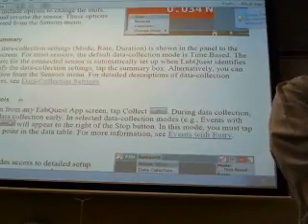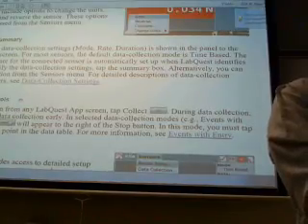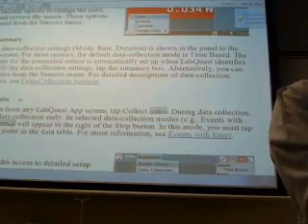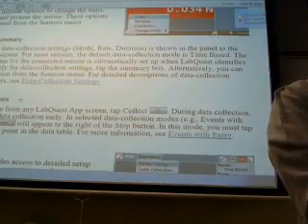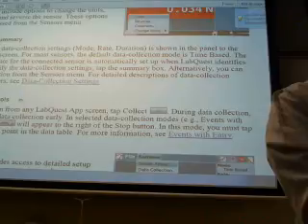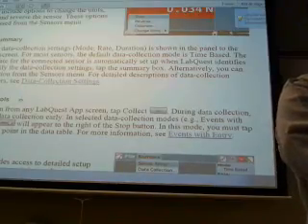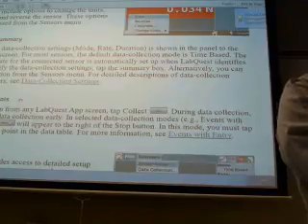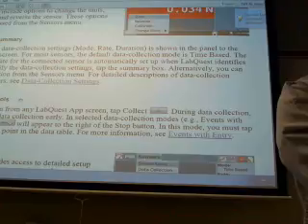If you look at File, do you see File? Sensors? Okay, hit Sensors. Which one? Third one from the top left. File, do you have this? Are you looking at it like that? Do you have File, Sensors? Okay, good. If you touch File, what happens?